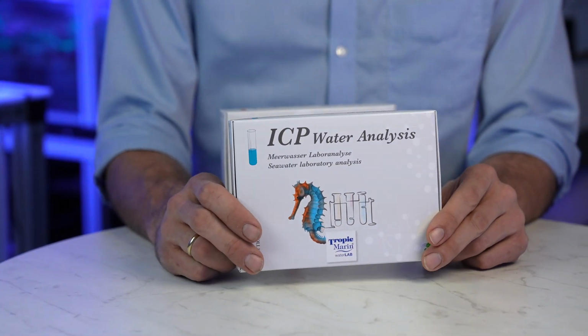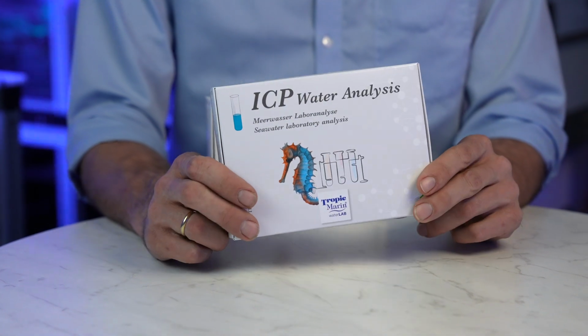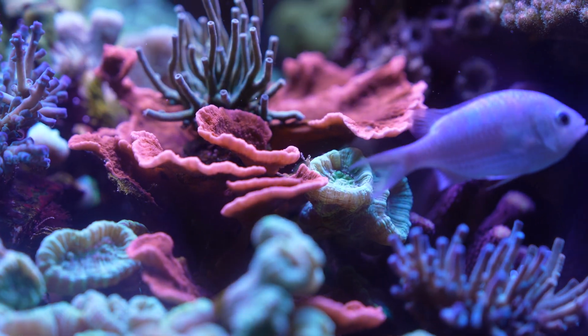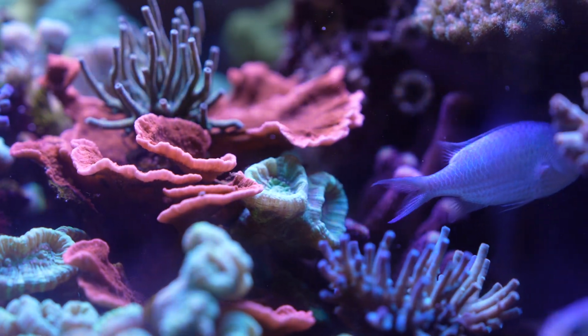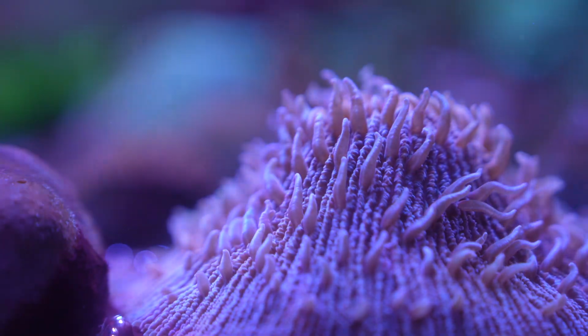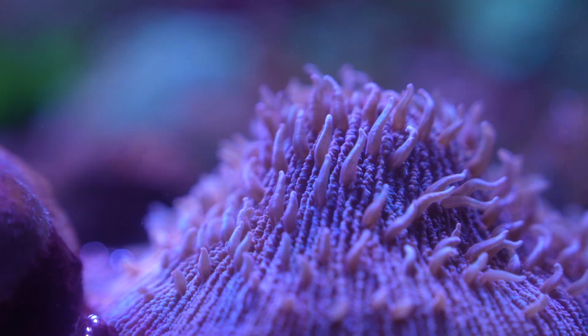For a home tank, I wouldn't send in one every week. Sure, it's great to get the data, but considering that you have a really good eye on it, you know it really well, and it's just one system that you need to keep an overview of, I would recommend once a month is sufficient, especially if everything is working fine and the corals are doing well. Then once a month is plenty.